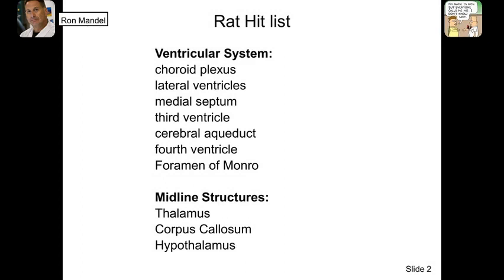In this voice thread, these are the structures that are most important, shown on this slide, but I'll be pointing out other structures as well that will be important later. There's no harm in seeing structures over and over.